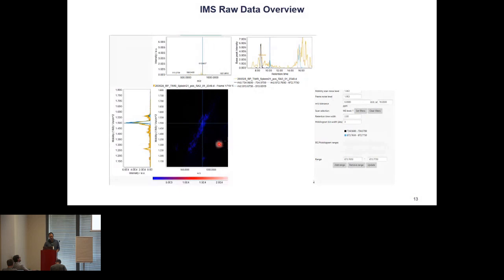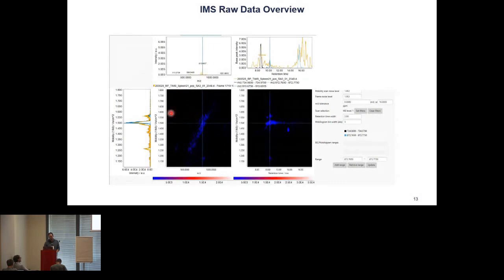And on the side, we see a mobilogram, which is simply a sum of all the signals across the mobility dimension. Now we also see the expanded version of the chromatogram, so the ion mobility trace here. And when you select a particular point in the ion mobility trace, you also see the individual mobility spectrum. So the sum of the mobility spectra is this frame. Okay, so it's a pretty complex view, but you can zoom with this, you can move with this, so it's all interactive, and you can see your data in all its complexity.